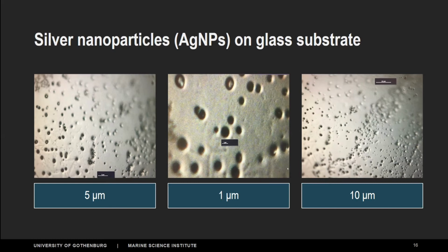But the idea is we want to get them close enough to create these junctions to enhance my signal, because the molecules are getting stuck in these junctions. And if you have V-shaped junctions and troughs, even better than the round shape. But you don't want them too tight together either, because that can lower your signal. So you don't want too much aggregation. And that was another idea we worked with to overcome the kinetics and the chemistry, to create this aggregation that will enhance my signal and the reaction time.